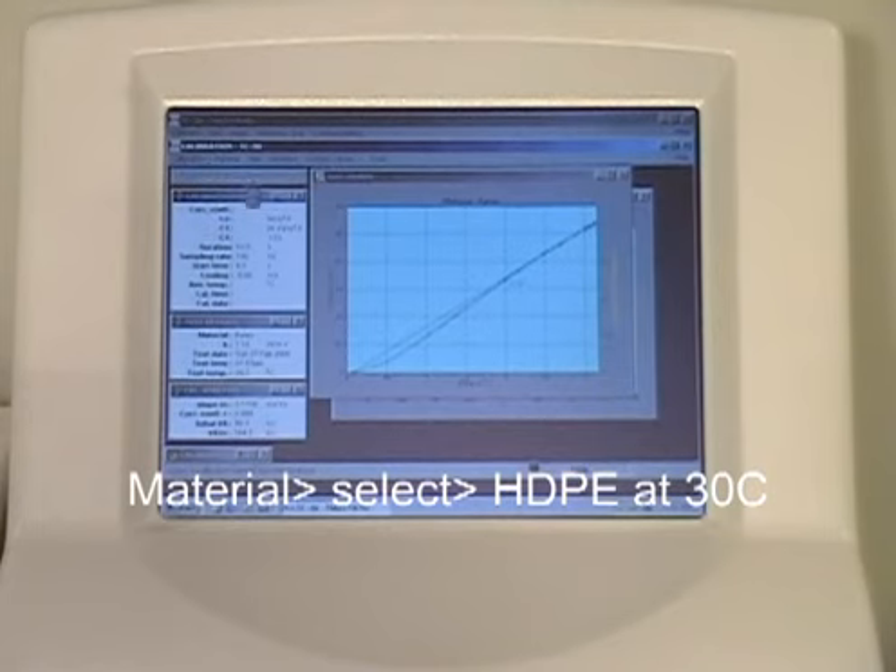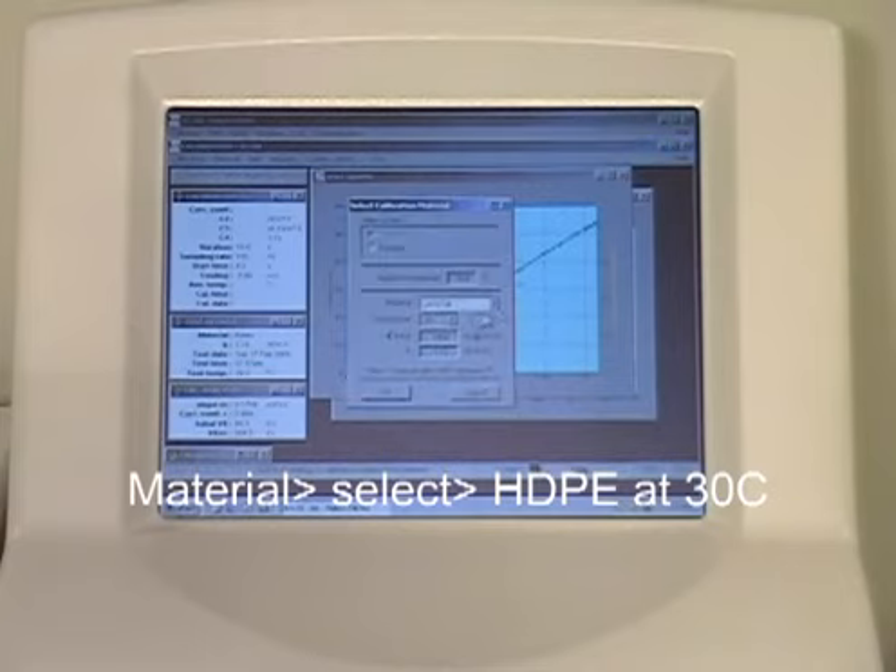The next step is to select your next reference material. This is accomplished by clicking the Material button in the top menu bar. Click the Start Calibration test.